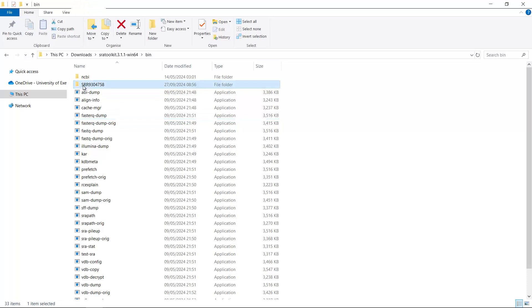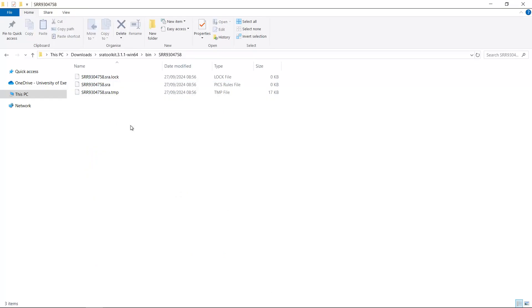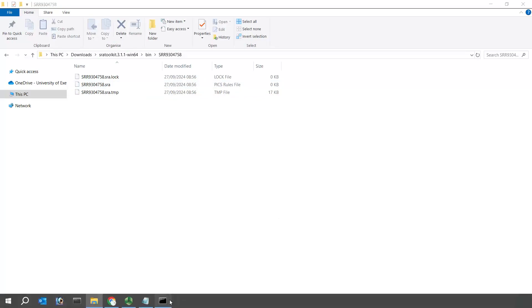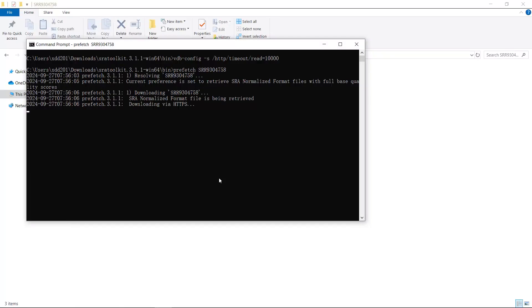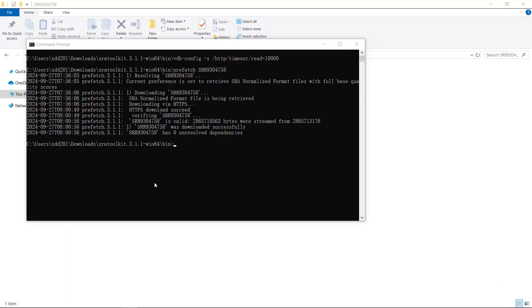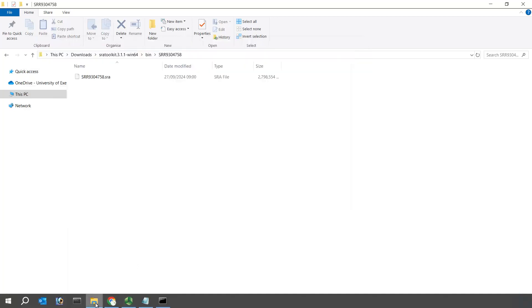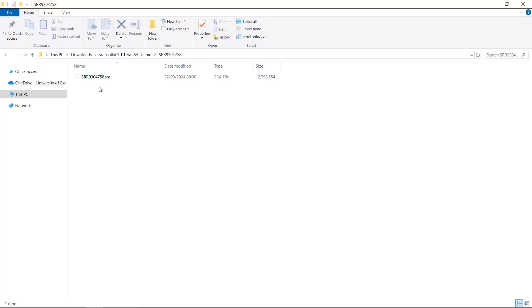Looking at the folder, you can see the computer is currently downloading the data with 3 temporary files present. After downloading finishes, only one file will remain in this folder. Going back to the command shell — you can see it is still downloading. Once complete, we have successfully downloaded the data. The folder now shows only one file, but it is an SRA file, not a FastQ file, so we need to use the fastq-dump function to extract the data.